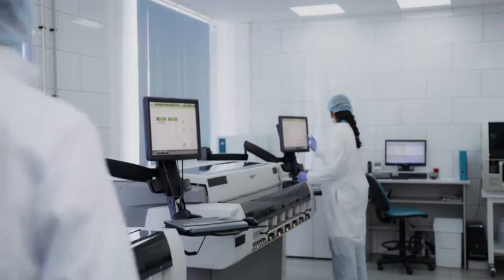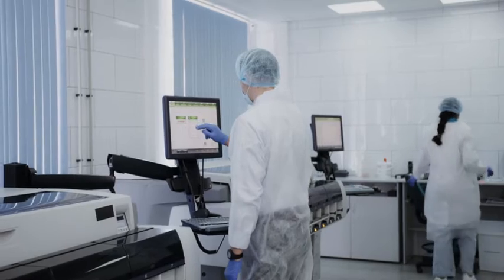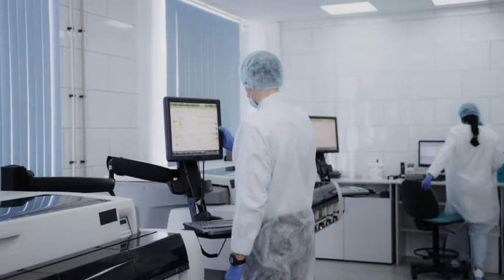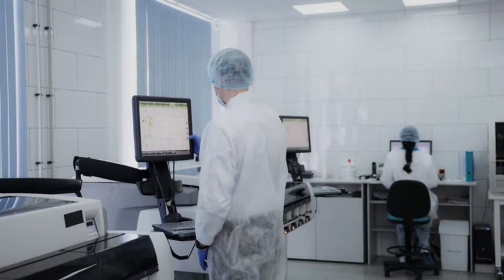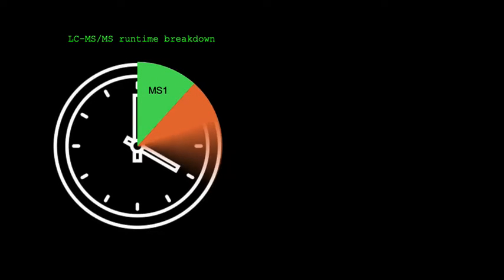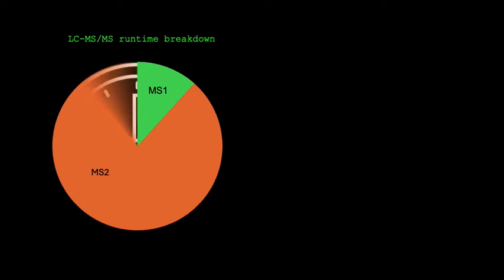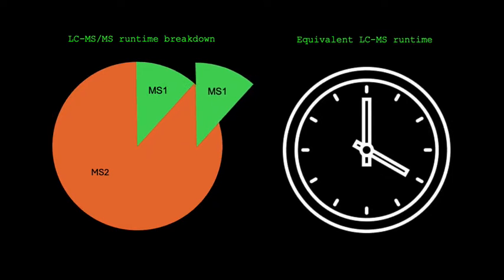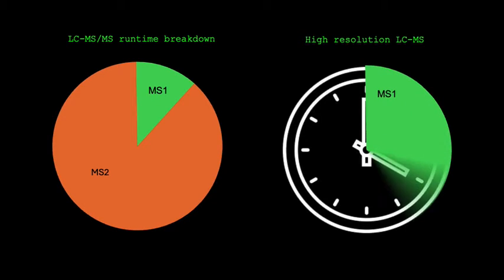When performing LC-MS-MS with MS2 scanning, 90% of the instrument time is devoted to MS2 scans. Since Compass does not require MS2 scan data, it is possible to perform feature-first proteomics and collect only MS1 scan data by LC-MS. Without performing MS2 scans, instrument time required for each sample can be dramatically reduced even if higher resolution MS1 scan data is collected.